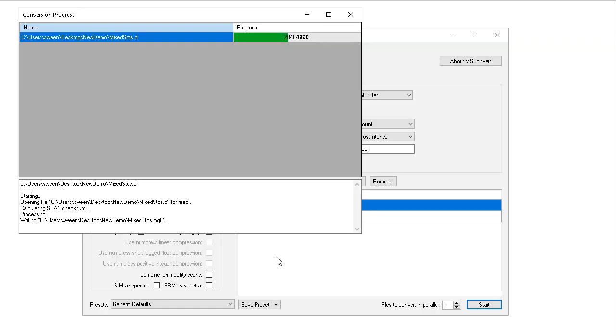So of course, we can relate one to the other. The MGF format for the MS-MS includes the mass of the selected precursor ion, but some vendors don't do a lock mass correction, and they don't apply that lock mass correction to the precursor ion. So to be safe, we take that mass from the full scan data, which is after the run, corrected for lock masses.